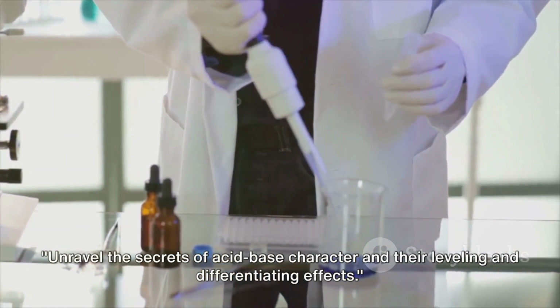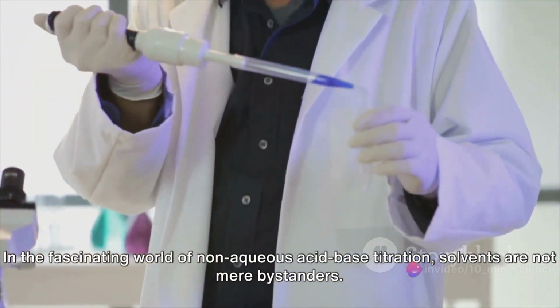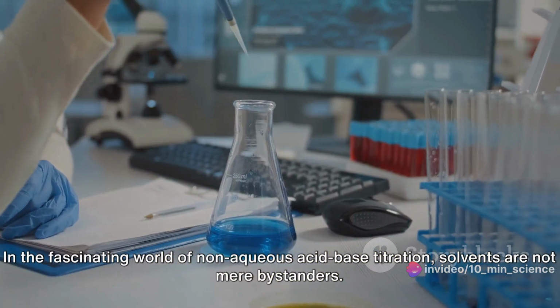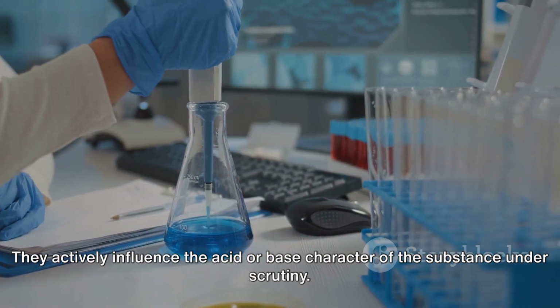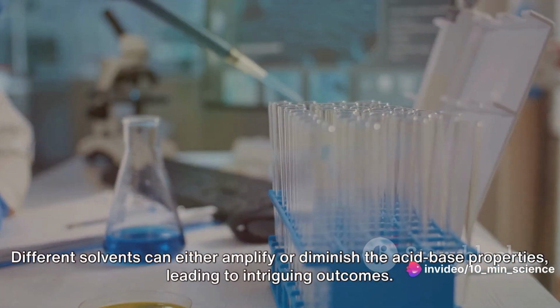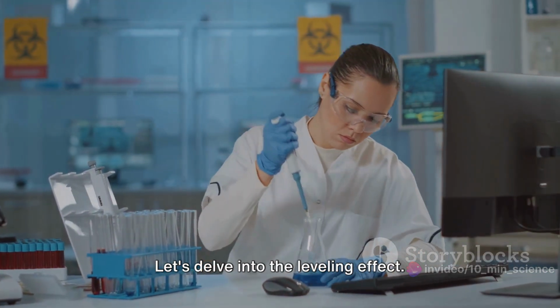Unravel the secrets of acid-base character and their leveling and differentiating effects. In the fascinating world of non-aqueous acid-base titration, solvents are not mere bystanders. They actively influence the acid or base character of the substance under scrutiny. Different solvents can either amplify or diminish the acid-base properties, leading to intriguing outcomes. Let's delve into the leveling effect.